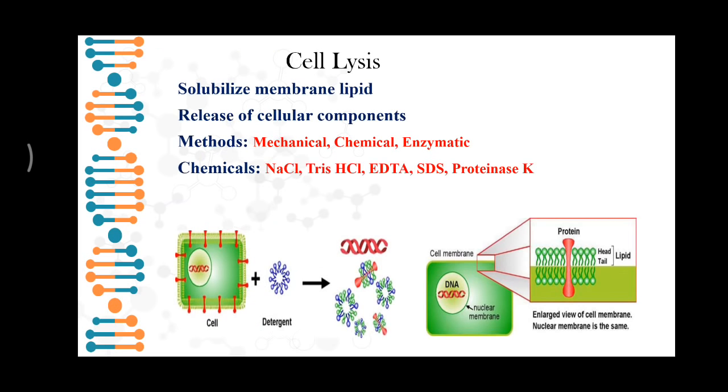So we'll go into the first step, cell lysis. We have to break open the cell by means of mechanical, chemical and enzymatic methods to release its cellular components.